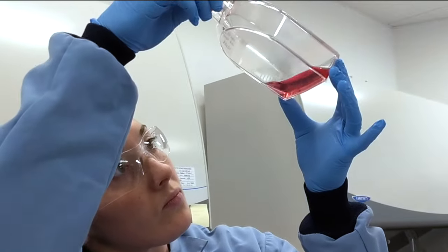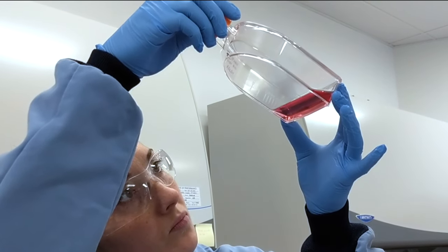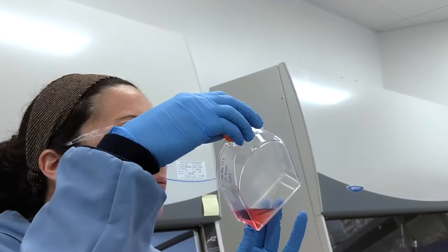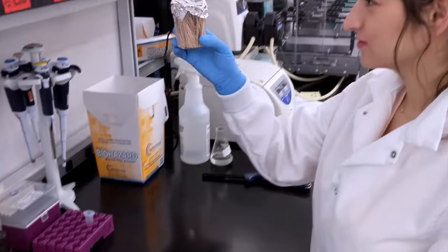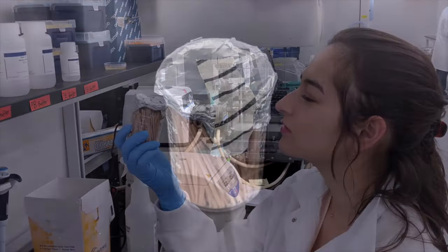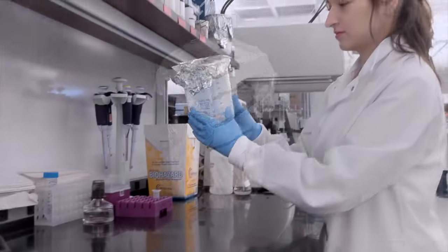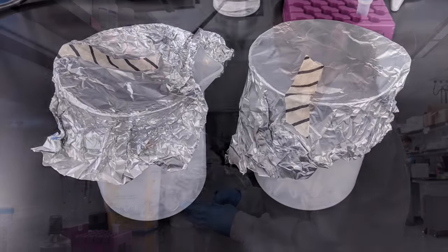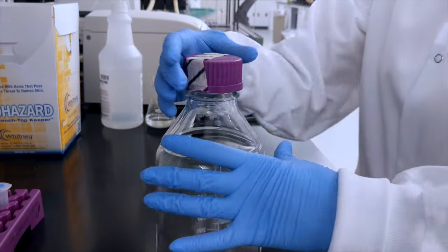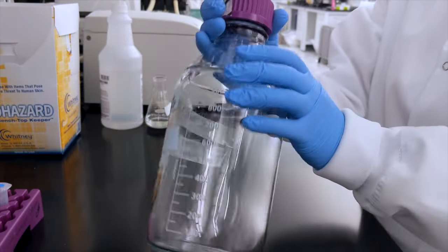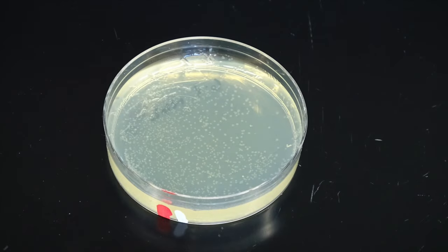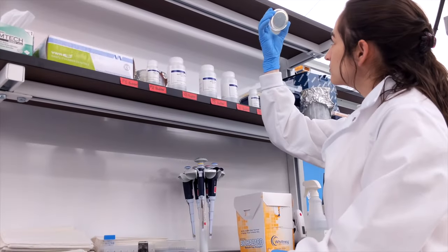Before beginning a task, examine all of your materials for signs of contamination or signs that the sterility may have been compromised. Check all autoclaved items to ensure that the indicator tape has changed colors. For items that are covered with foil, check for tears or holes. For capped items, ensure that the cap has been tightly sealed. When working with agar dishes, examine the dishes for signs of microbial growth.